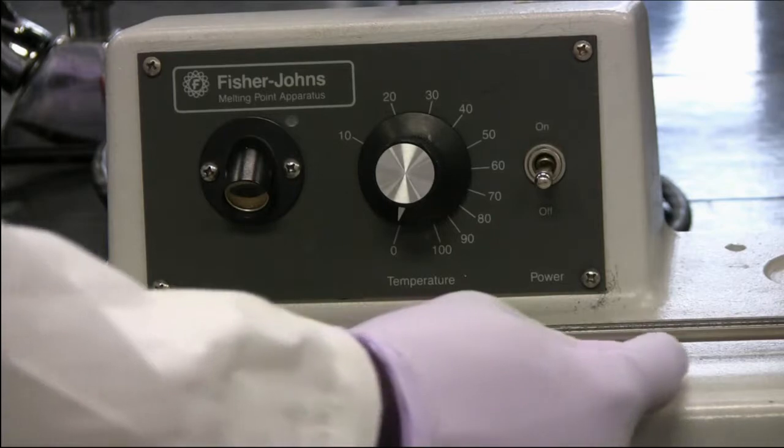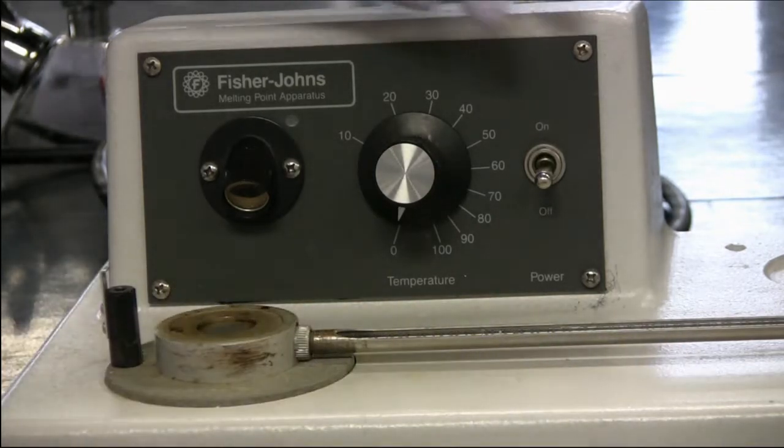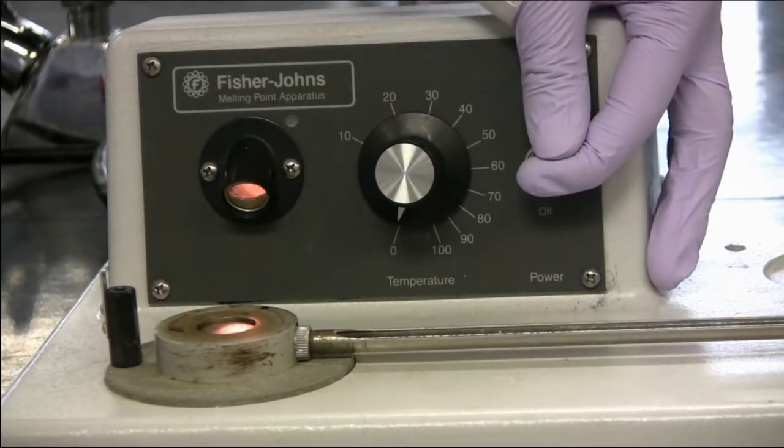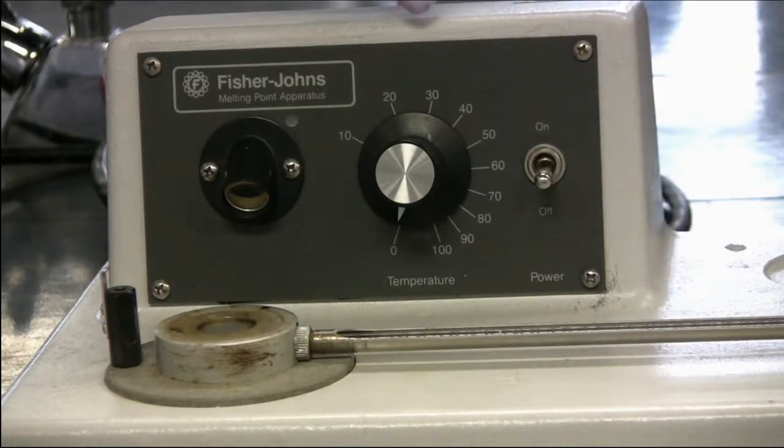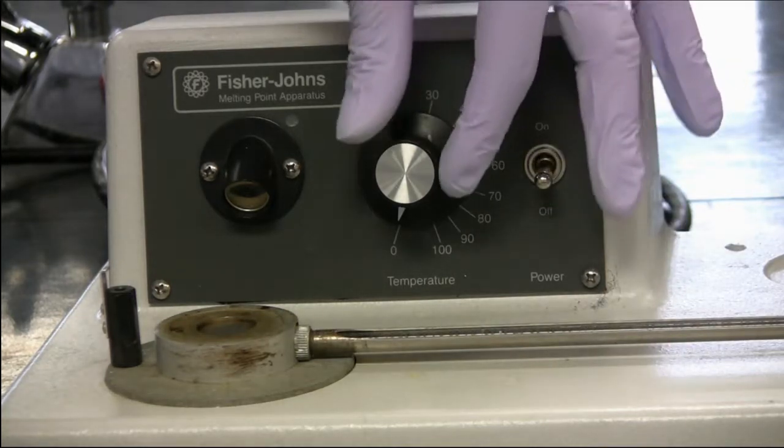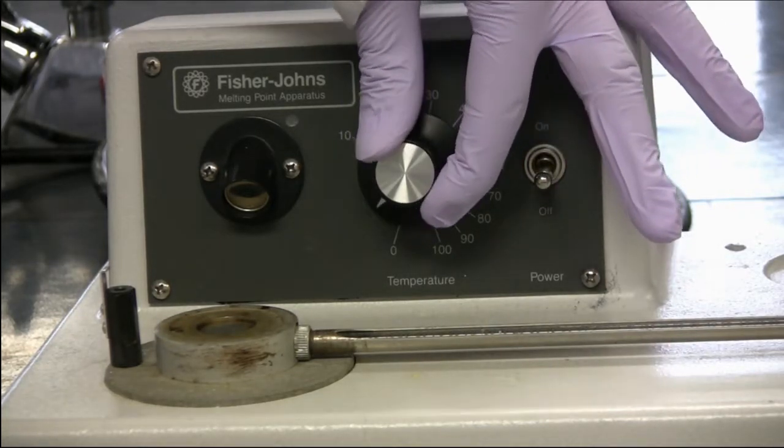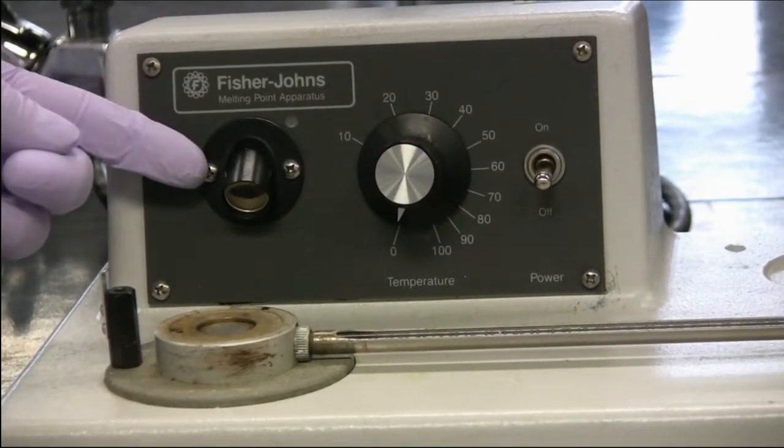This apparatus contains a thermometer, an on and off switch for the light and the heating element, an intensity knob for the temperature, and the light source itself.